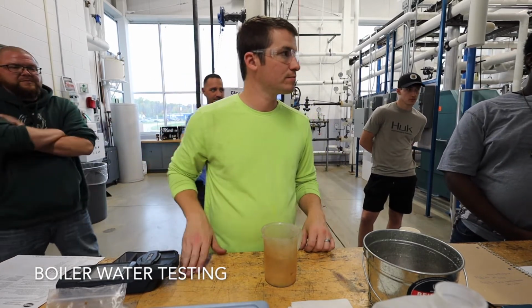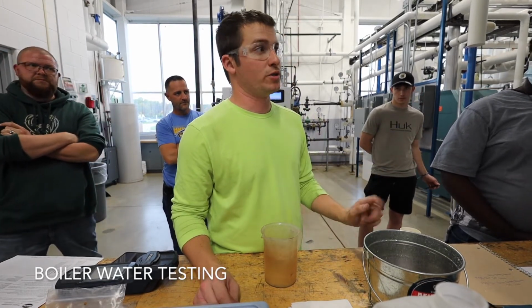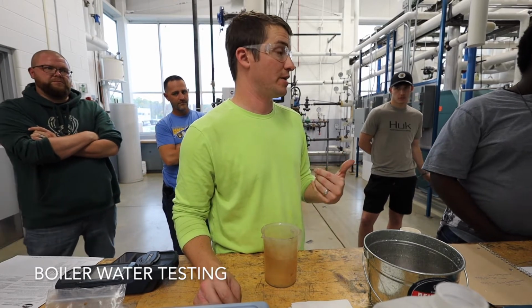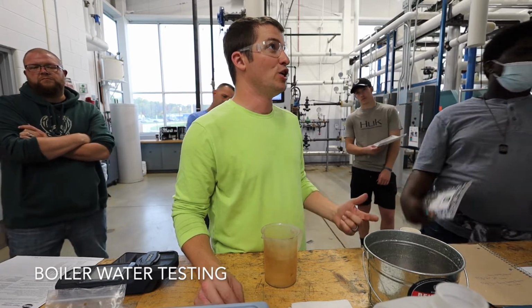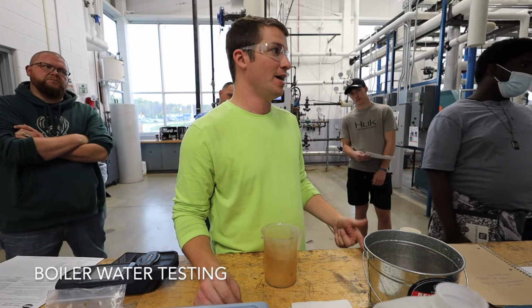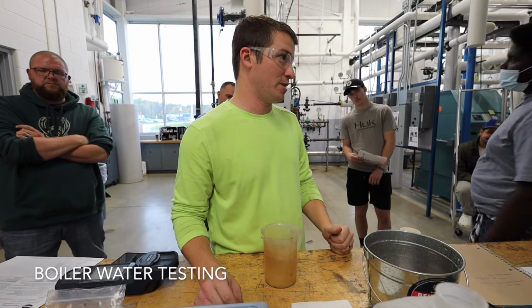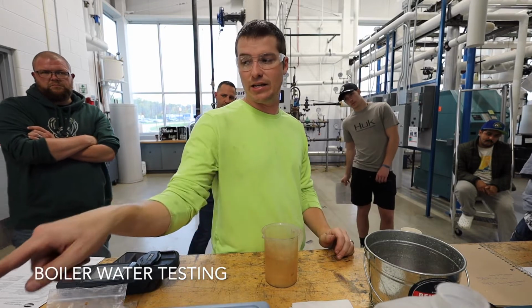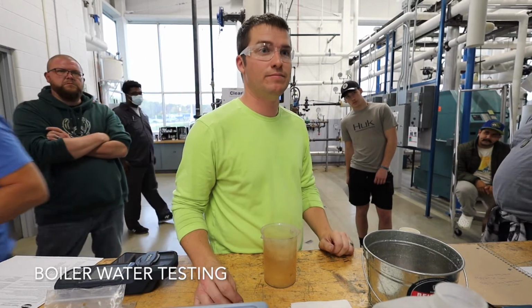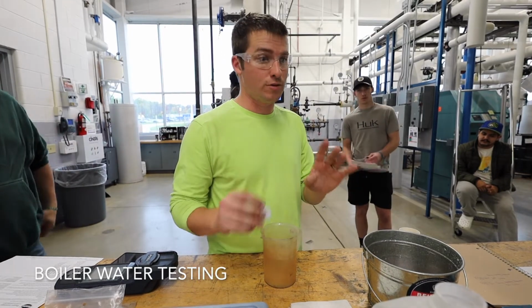Is that for any boiler? Any boiler what? That we don't test pH? Yeah. I would say yes, because if you have a healthy amount of O alkalinity, your boiler pH has to be above a certain level, and above that level, I'm not concerned about corrosion. Some chemical providers will want you to test the pH of the boiler. I just find it's a worthless test that's not going to tell me anything that I can't infer from the alkalinity. We're going to still do pH tests on all of it, that's fine. We'll do it in the condensate today when we're done. And you can do it on all of them just for practice.